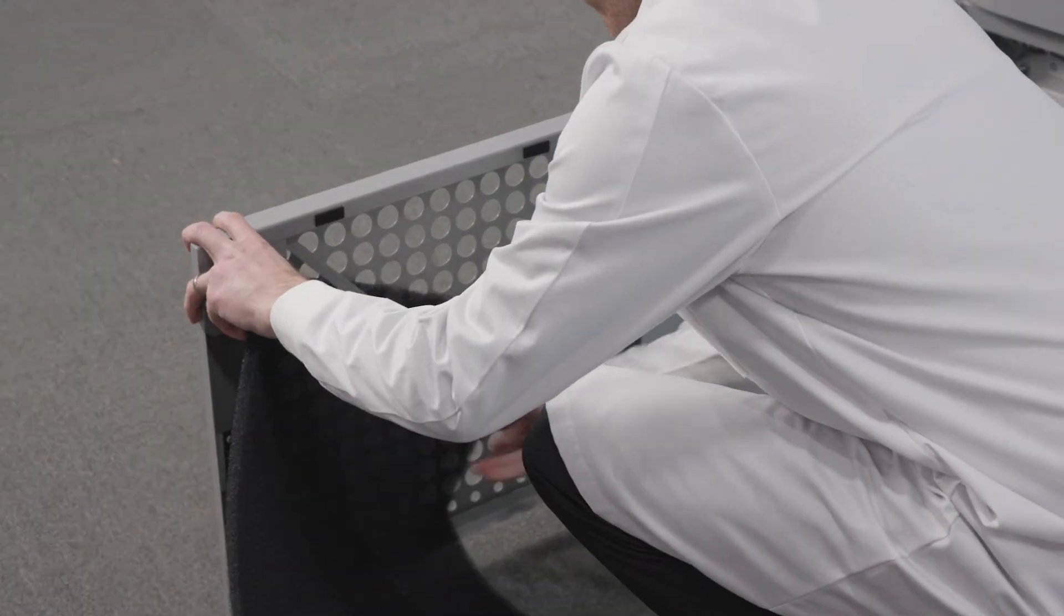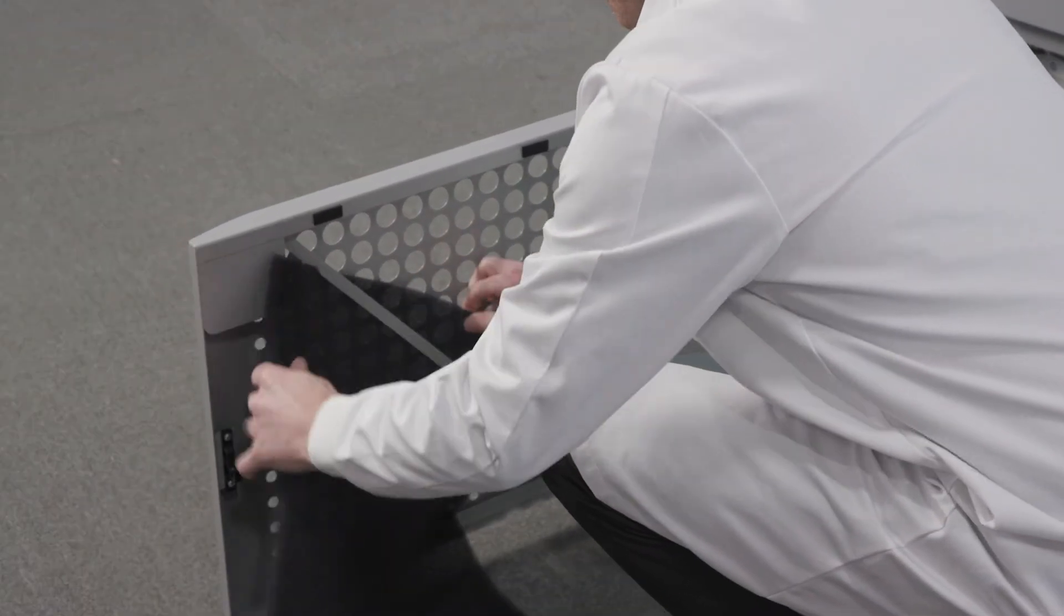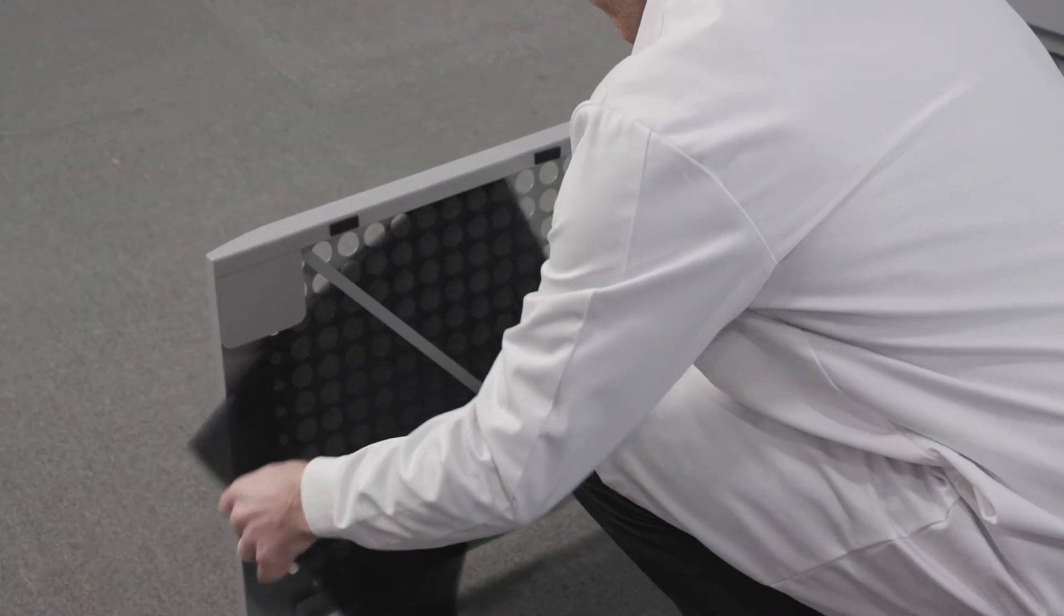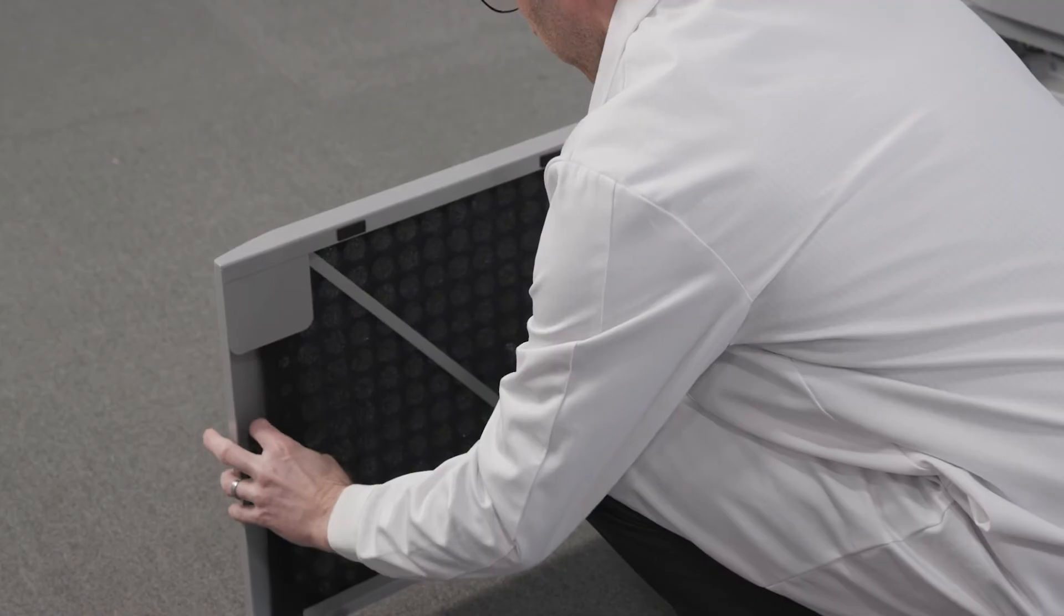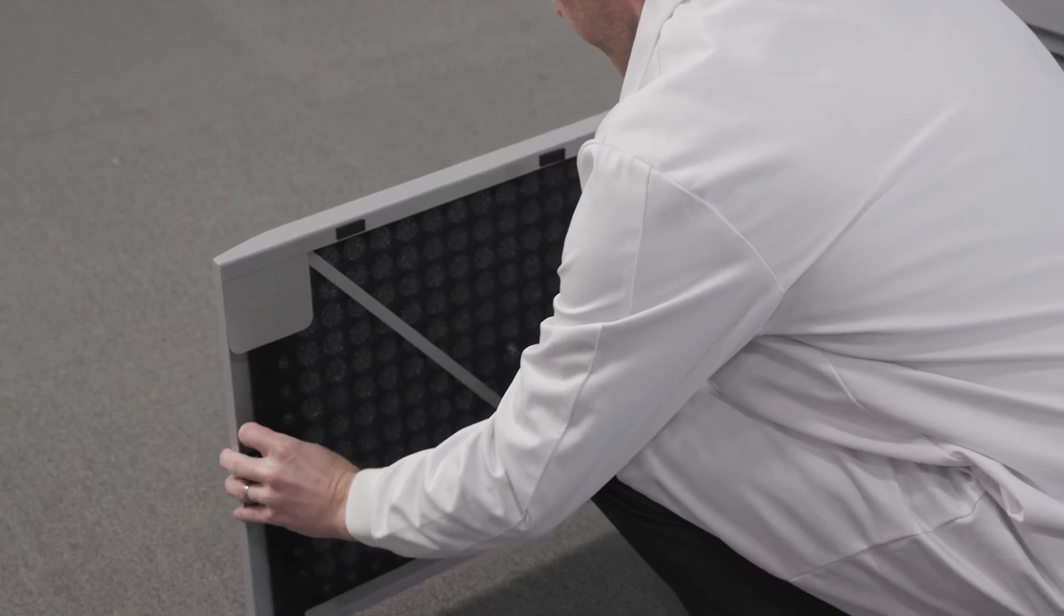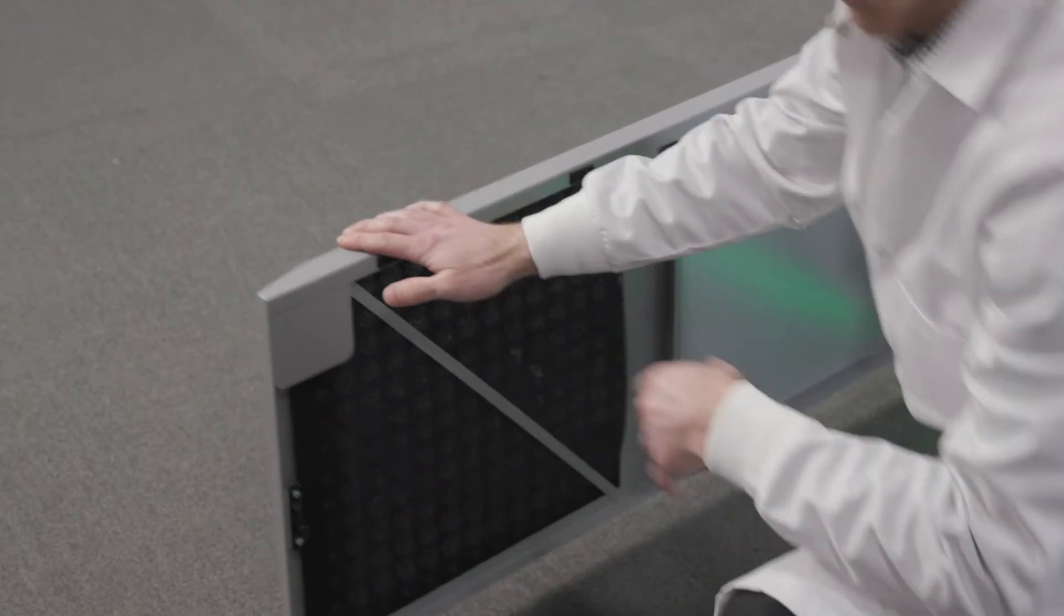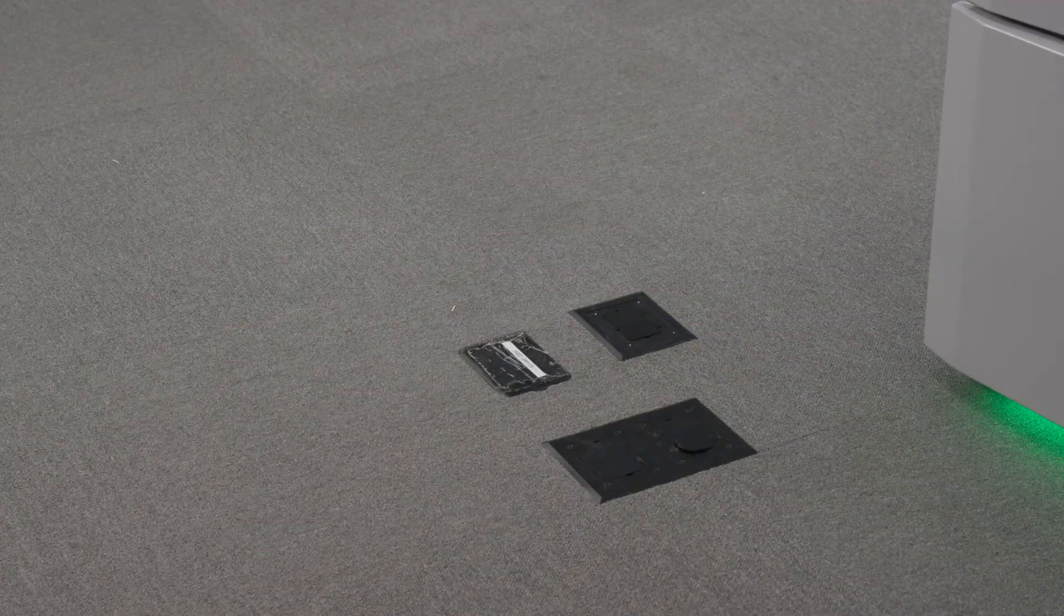This airflow is critical. Routinely check the condenser filter for debris and either vacuum and clean the filter or replace the filter when necessary.